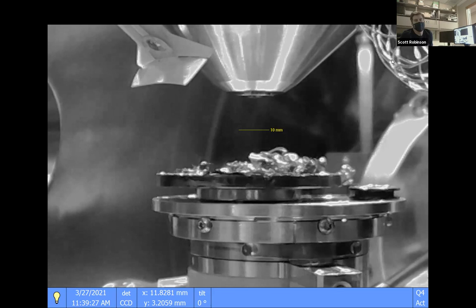So what's happening is, every second there are millions or billions of electrons. Some of them are bright, with more signal, and some of them have less signal. And that's what allows us to see what we see.